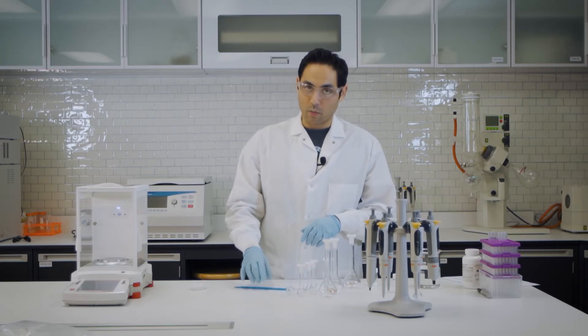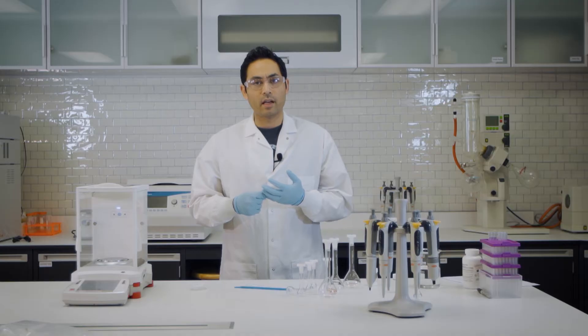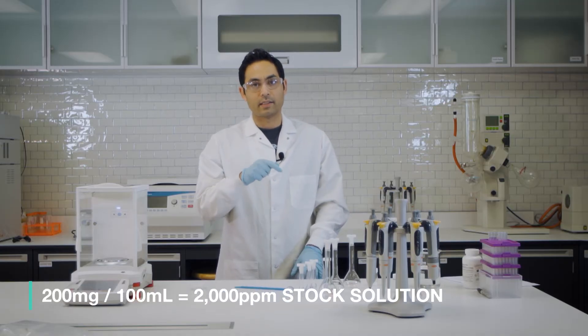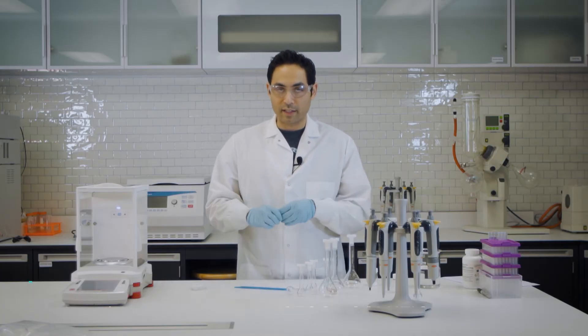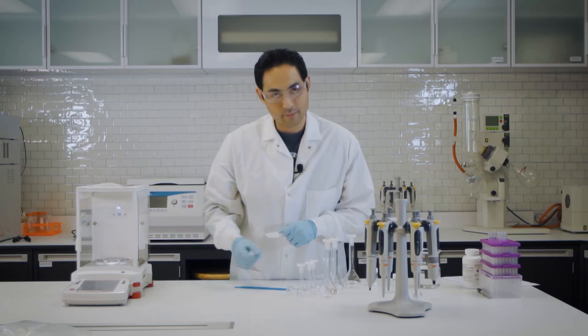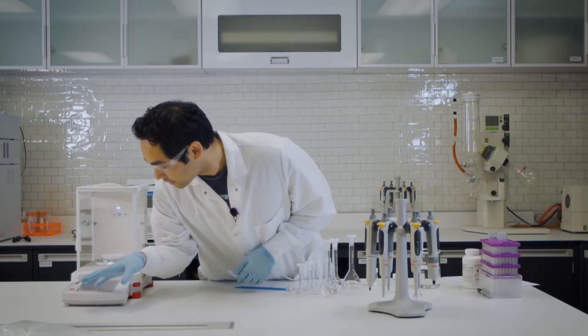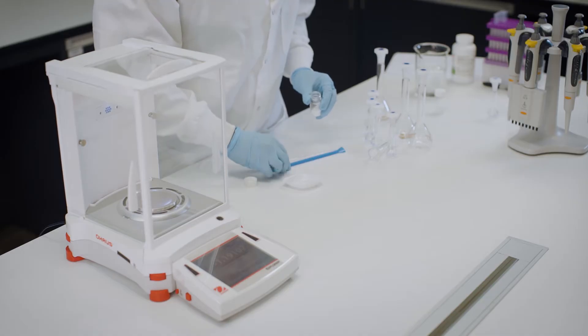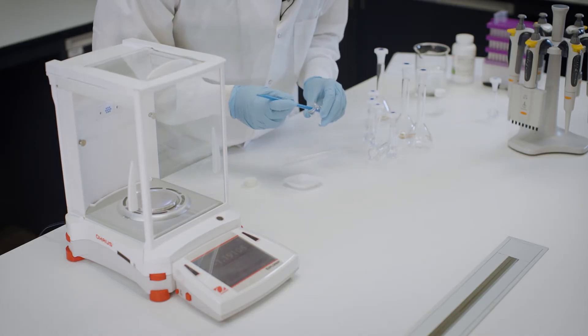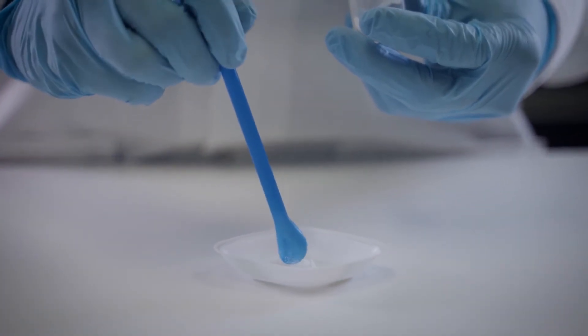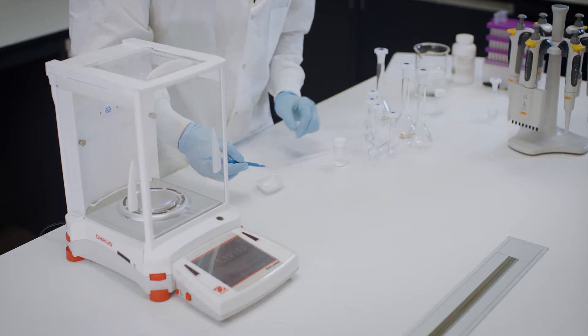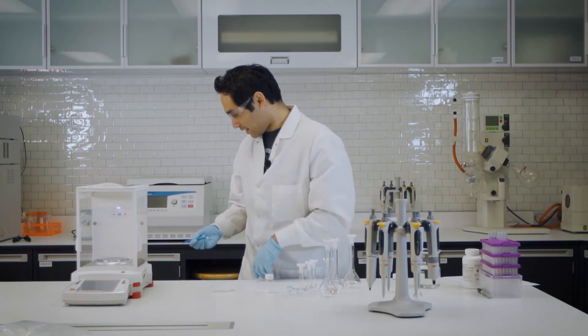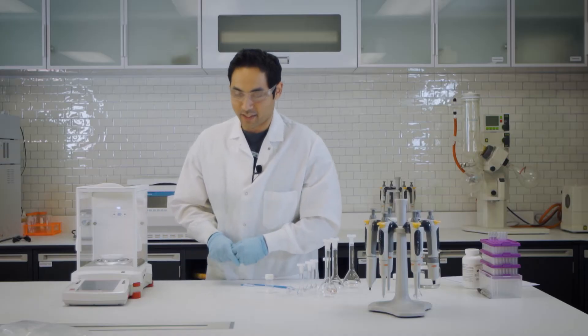So the first thing we're going to do is we're going to weigh out roughly 200 mg of NEAT. If we go 200 mg into 100 ml, that'd give us your 2000 ppm stock solution. First, tare the weigh boat. So we're going to weigh out about 200 mg of this. And we need a little bit too much, so we'll take some out. So that should be good. That's about 200 mg.